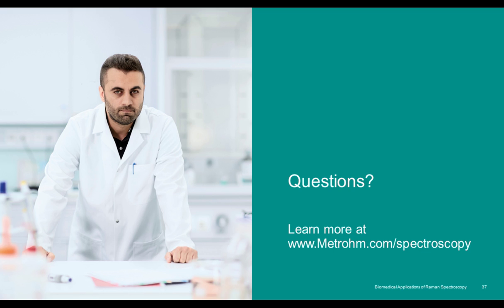There are other types of lasers that we can use to do Raman spectroscopy, like gas lasers and UV lasers as well. They go down into the UV, but those tend to be a little bit more intensive experimentally. So for the semiconductor lasers, we have our 532, our 785, and our 1064, which should cover most very common applications.